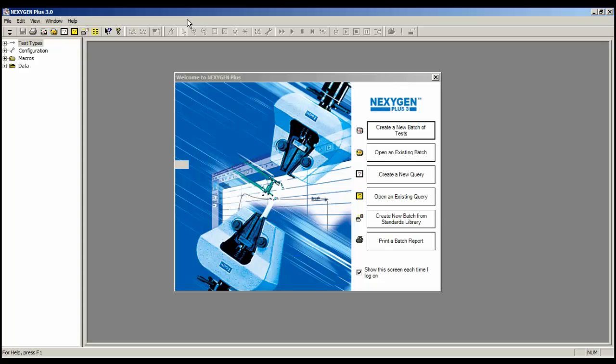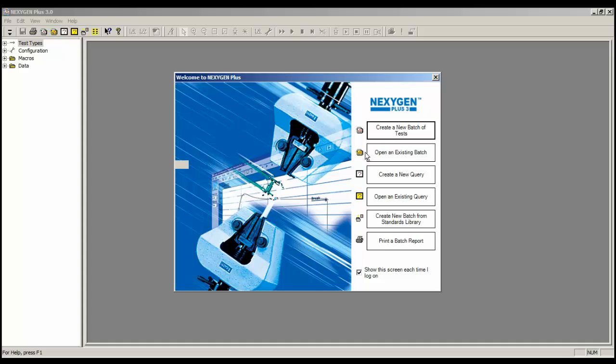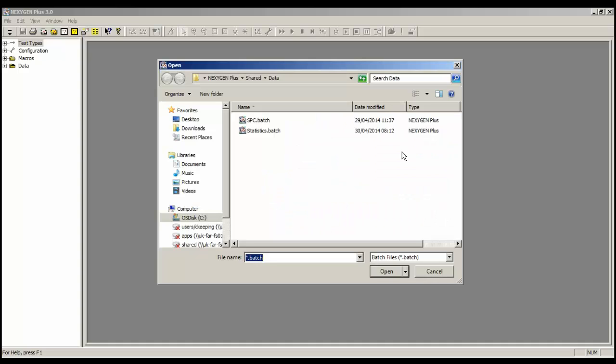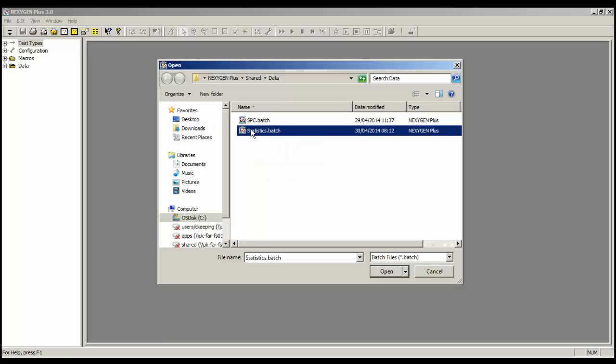Firstly, let's open a batch file that contains many tests. To do that, I'm going to use the Welcome screen, click on the button Open an existing batch. The dialog shows me files on my computer, and I'm going to select and open the file I need.